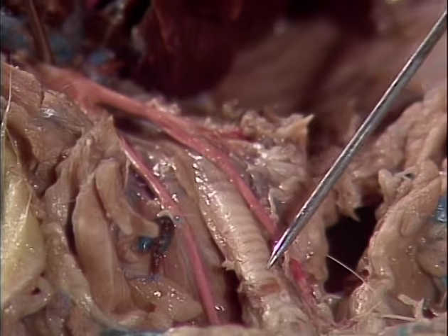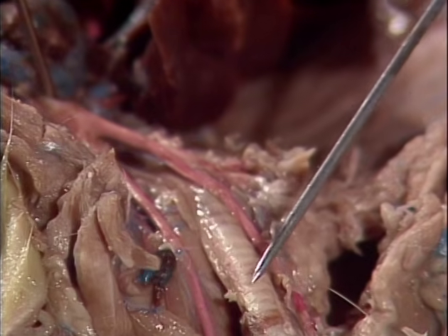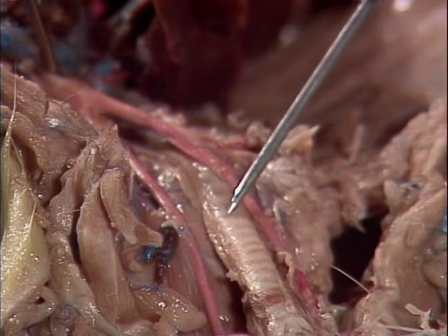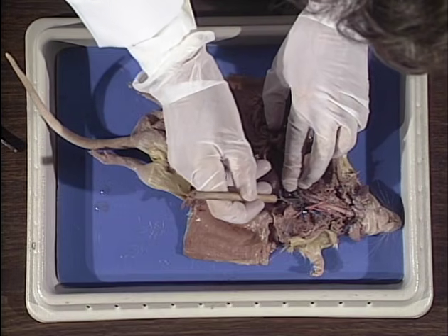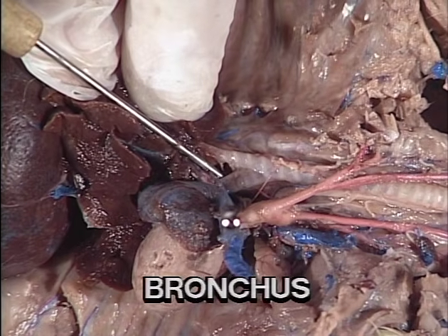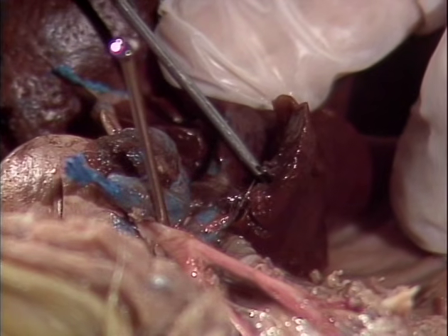Continuing from the larynx is a long tube known as the trachea. As you look at the trachea, you can see small rings going across it. These are made out of cartilage and prevent the trachea from collapsing. If we follow the trachea down, we will see that it will branch near the heart into a right and left bronchus. The bronchus will lead into the lung, where it will branch again into bronchioles.